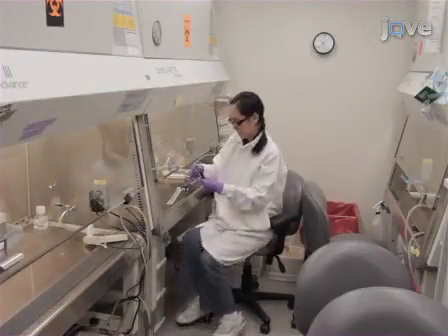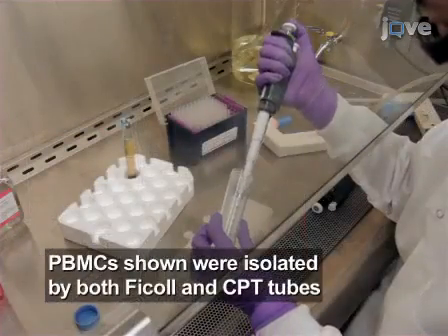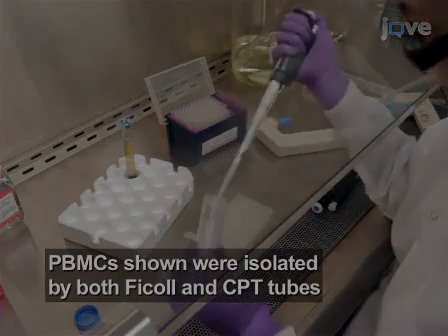After isolating peripheral blood mononuclear cells obtained from human volunteers, resuspend the recovered PBMCs at 3 × 10⁶ cells per 0.6 milliliters of medium.